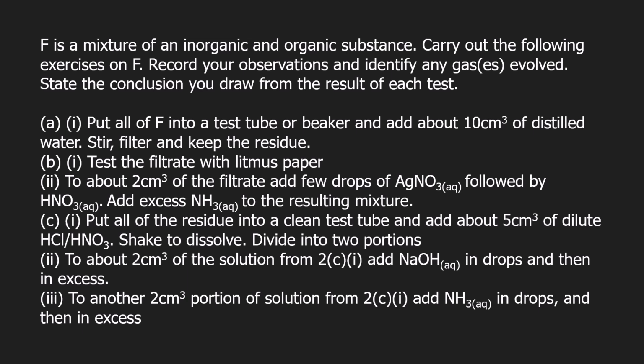To about 2 cm³ of the solution from 2Ci, add sodium hydroxide in drops and then in excess. To another 2 cm³ portion of solution from 2Ci, add ammonia in drops and then in excess. Now these are the questions I have prepared so that we can analyze this. Now let's see the analysis.